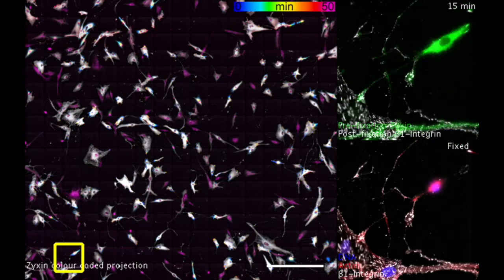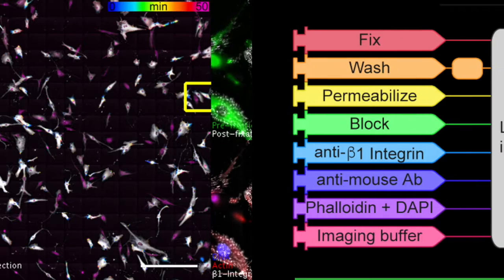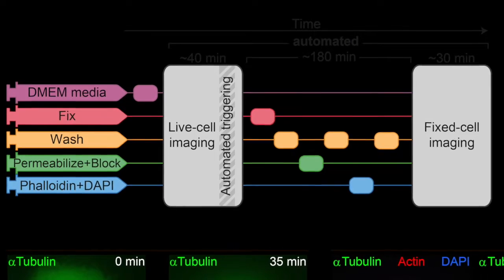For example, here we started a live cell experiment where we detected cells entering mitosis and triggered the labeling sequence followed by large multicolor imaging.